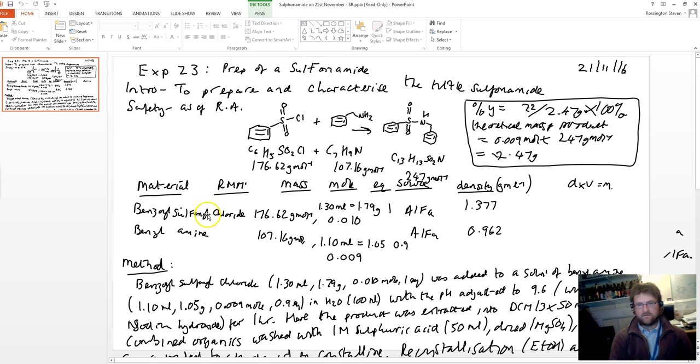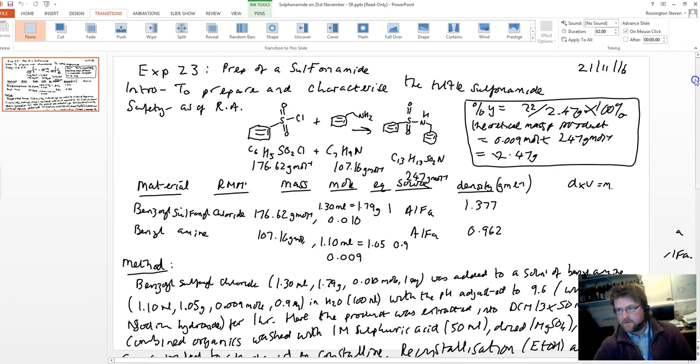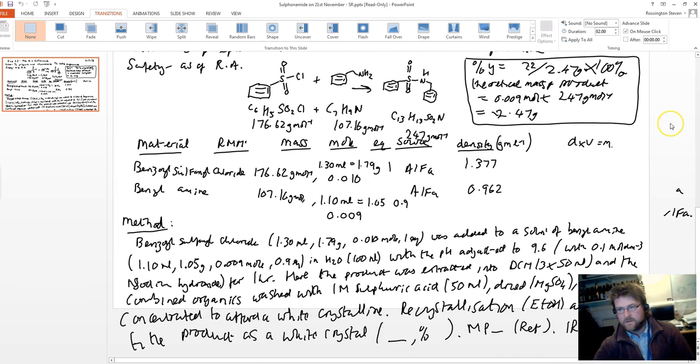So the two reagents were liquid, so once we find the density and the volumes are given, we can find the masses, as shown. This allows us to calculate the number of moles, as shown here, and then equivalents. And with that in mind, we write up, obviously, in this third person past tense idea, as we see here. A percentage yield is a calculation you have to do.